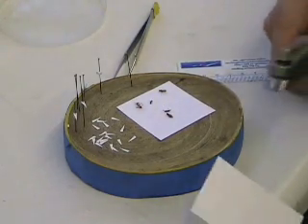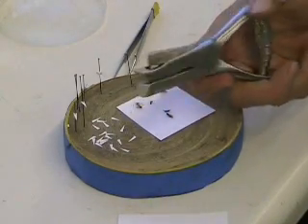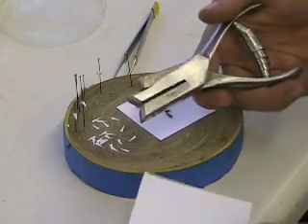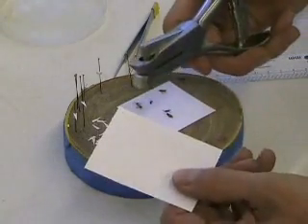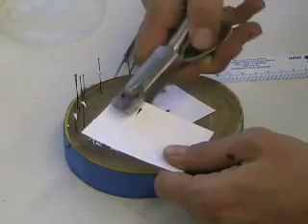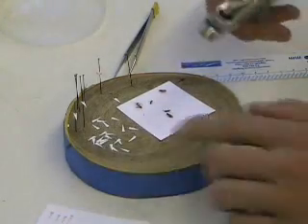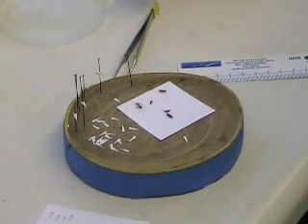Now in order to make points, you can have — it's like a hole puncher. You get these from BioQuip; they're kind of expensive. But you just use card stock paper and you cut little triangular pieces of card stock. And those are what you're going to use for your points.